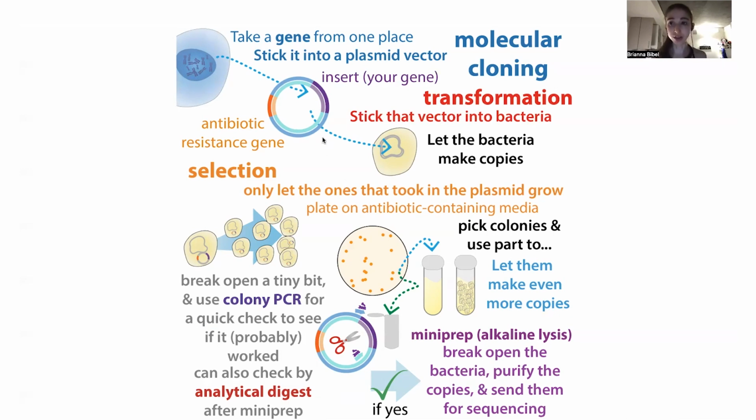So less of the cells are going to actually transform and take this up, and then less of them are actually going to have a functional plasmid, and this is going to make it so that you're going to get fewer colonies. Each of these colonies that you're going to get on your plate is going to be a genetically identical group of bacteria. So basically an original bacteria that had that functional plasmid. It's going to take root and grow on top of itself, and you get these globby colonies, and then you could do various things with them.